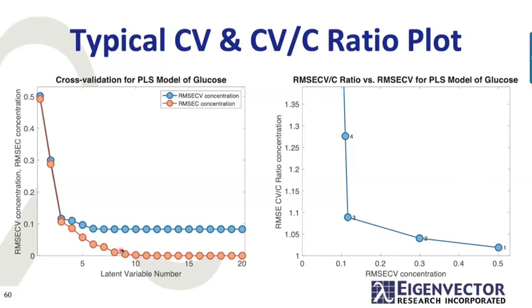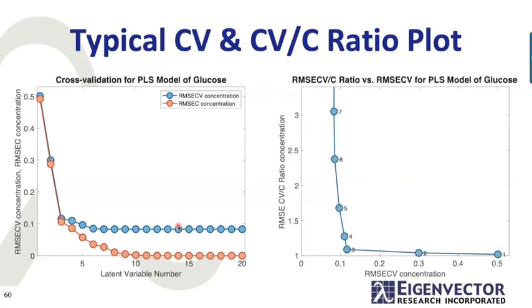So these models out in here are way overfit. Zooming in a bit on that, or actually backing out, you'd see that by the time I hit 10, we're at, I don't know, 10, 20, 100, somewhere out there.